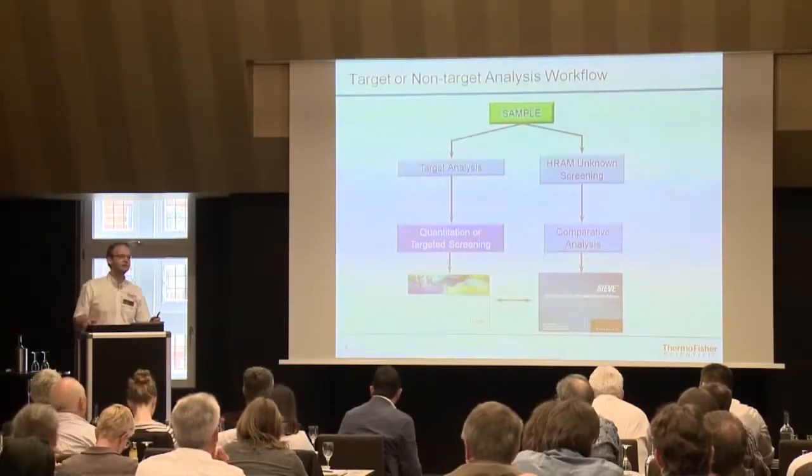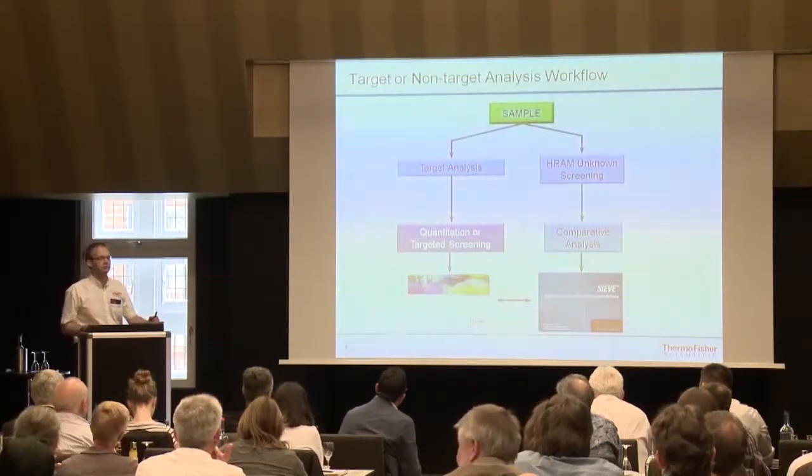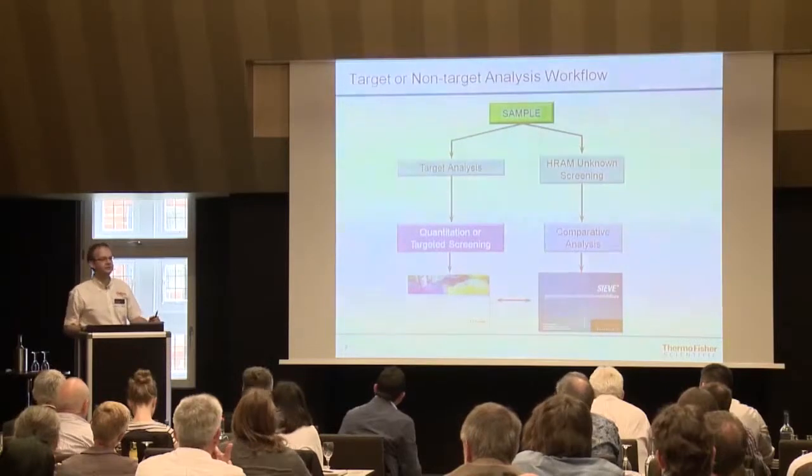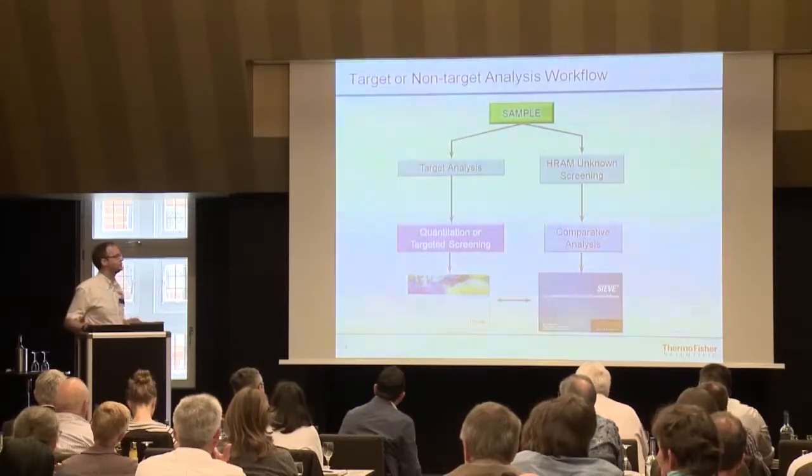The second method you could run, but I don't want to focus too much on that, I want to go into the software. There would be a little bit more facilitated AIF scanning, which is called data independent acquisition, DIA. But to go to the software.